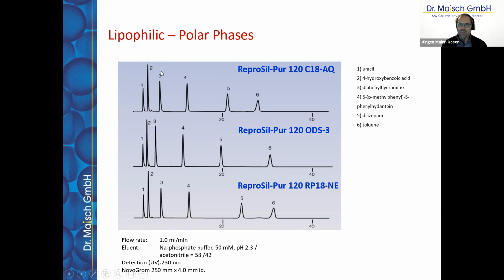The same we see also for peak number 3, diphenylhydramine, which is a strong base, and also we see clearly more retention than for the other compounds. The same we can see for peak number 5, diazepam. Diazepam is on a standard C18 here at around 20 minutes. If we switch to a column which offers a polar interaction, the diazepam takes this interaction, and so we have an additional interaction which leads to higher retention times. We see it on the AQ phase, but also on the non-end-capped phase.